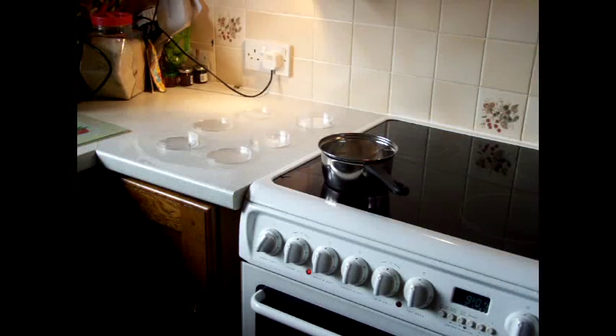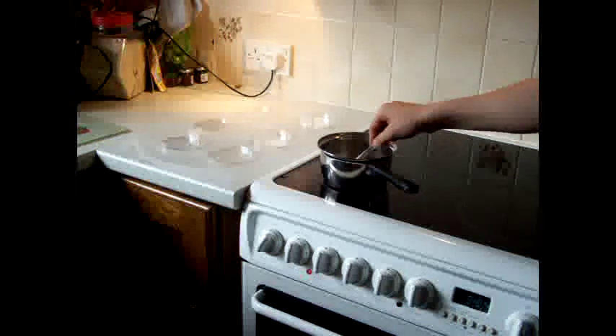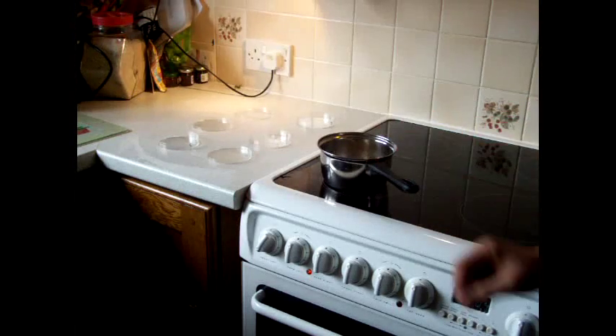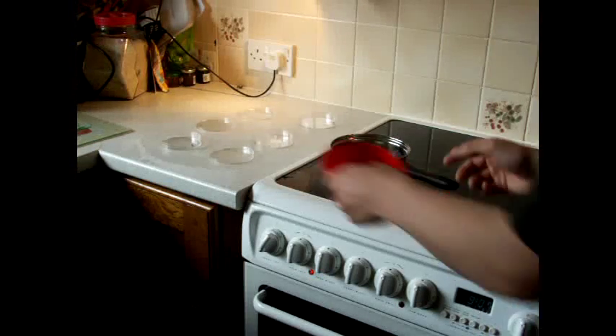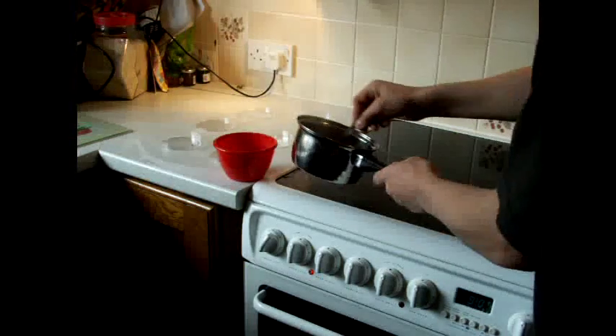Keep it on a low heat until all the agar has dissolved and you're left with a solution. Once the agar powder has dissolved, you'll be left with a light brown solution. When you get this, pour it into a microwaveable pot.